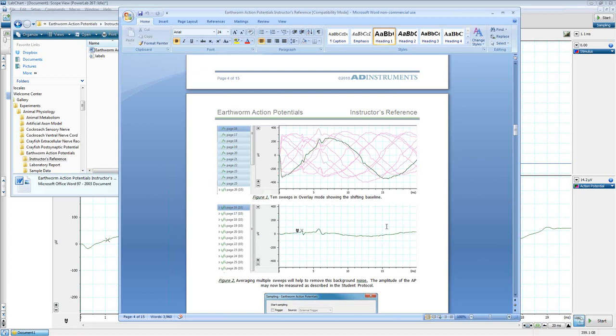Now we have the same capabilities to do this in LabTutor, we just don't have the ability for students to do this on the fly. This would need to be set up using LabAuthor in the background to actually have a scope average. So if you know that you have a particular noise condition in your environment, and we can test this using LabAuthor and setting up a scope averaging protocol in there that works around your particular noisy environment.